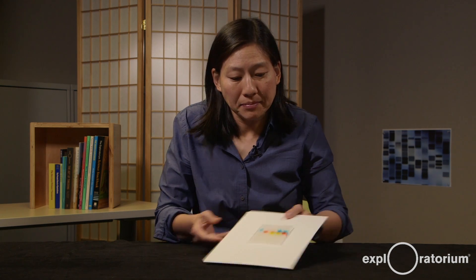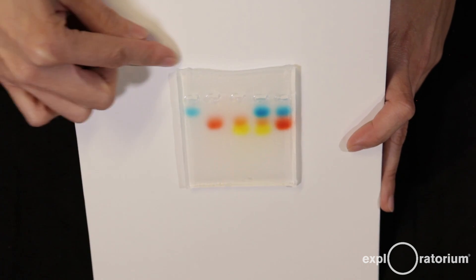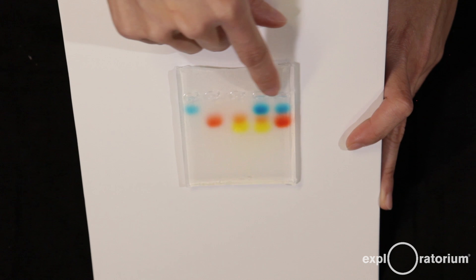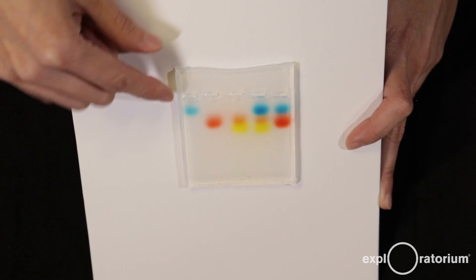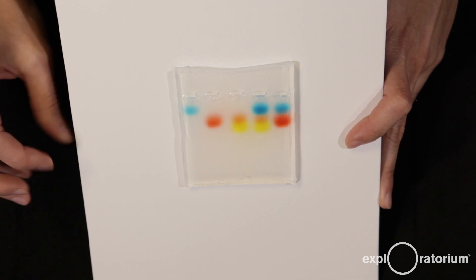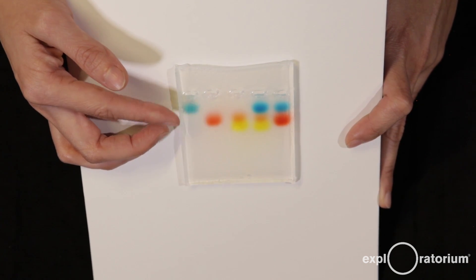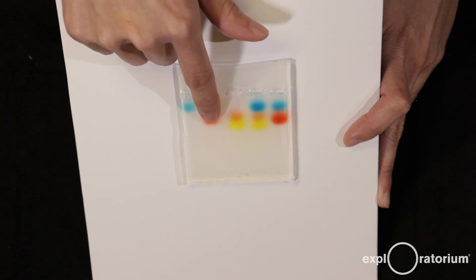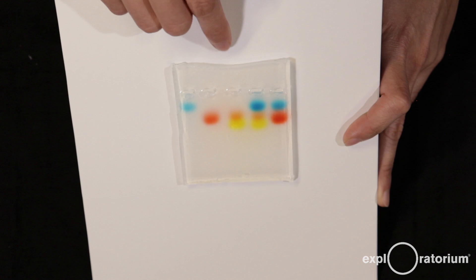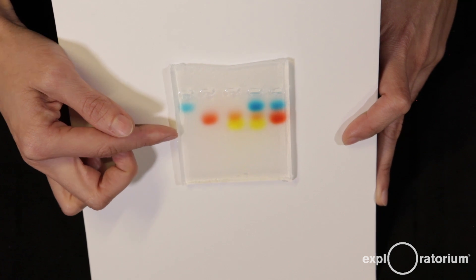So what happened? My gel ran for around 20 minutes. I disconnected the power supply, blotted it dry with a paper towel, and here it is. You can see the five dye samples moved down — from the negative electrode toward the positive — but they moved different distances. All of the samples moved, but at different rates. The blue dye moved the least, meaning it was the slowest. The red dye was in the second lane, the yellow dye in the third, and the yellow turned out to have a little bit of red in it. The yellow moved the furthest, meaning it was the fastest.